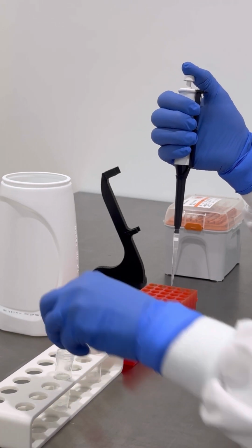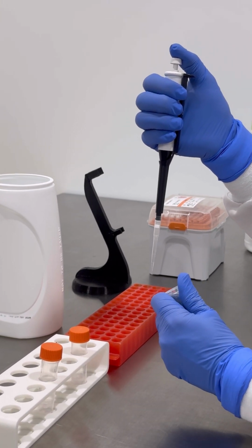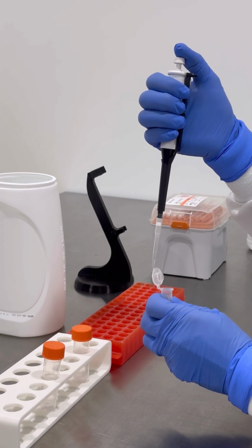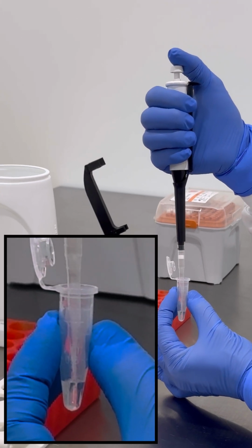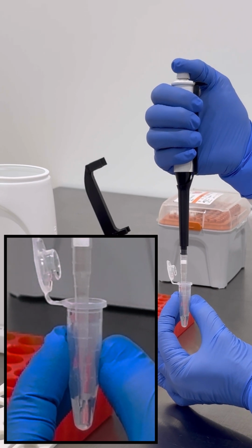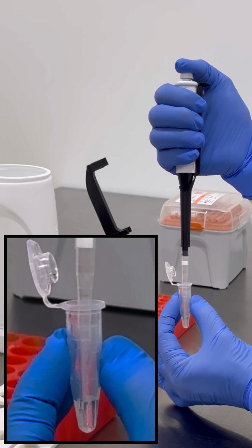Pick up the reagent tube and carefully open using your thumb to press upwards on the lid. Avoid touching any part of the lid that goes inside the tube. Place the tip inside the reagent tube and just into the top of the reagent liquid. Press the white button slowly to the first stop to eject the measured liquid. Mix the contents by slowly releasing and slowly pressing down the white button 4 times.